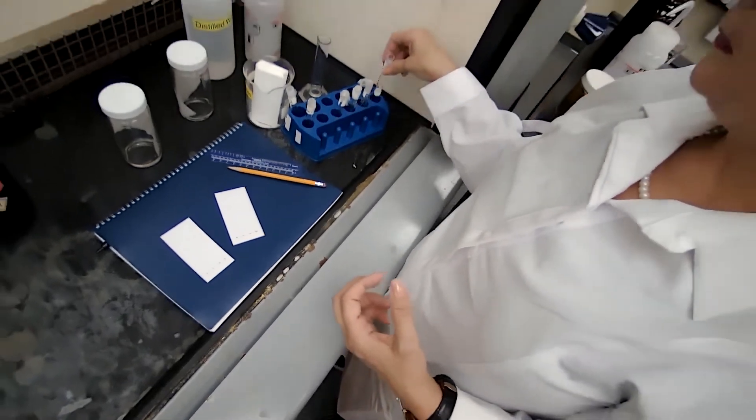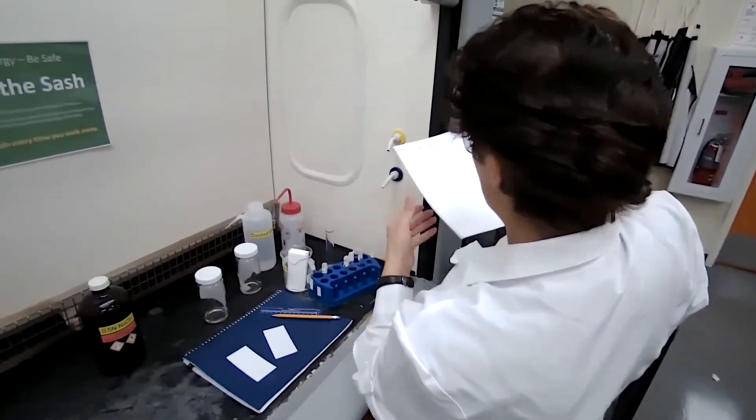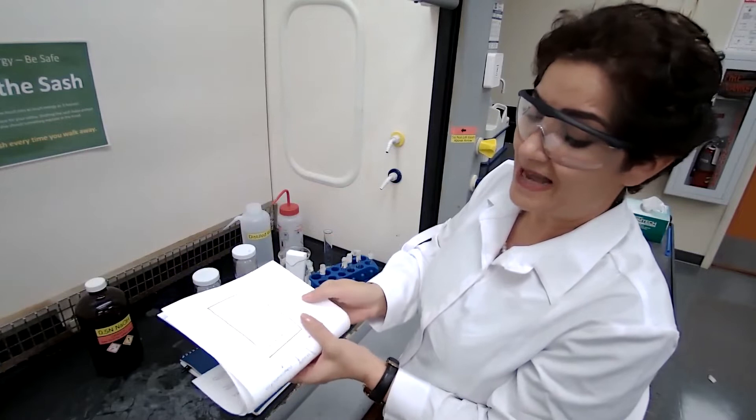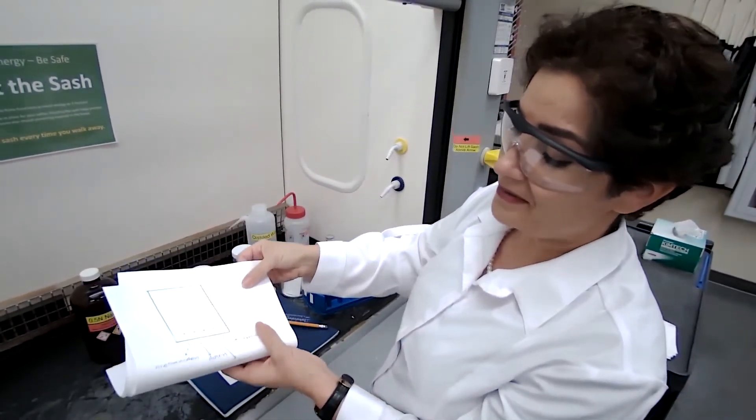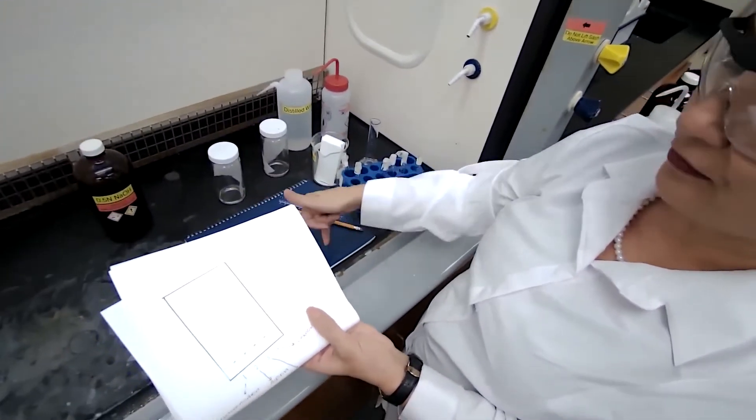When you are trying to spot the TLC plate, spotting the plate means you are putting the sample on a assigned area like I have in this diagram. I'm going from left to right.